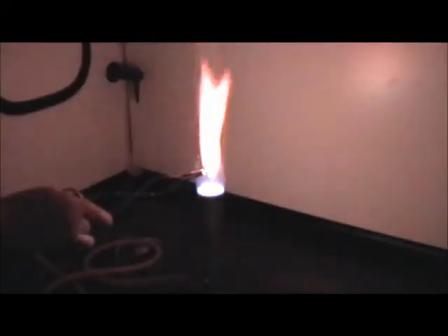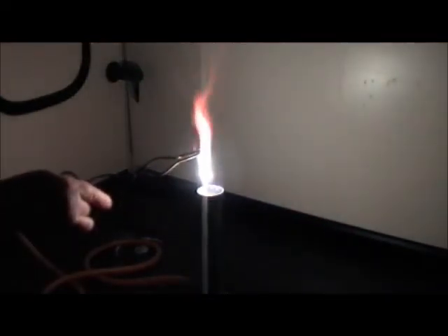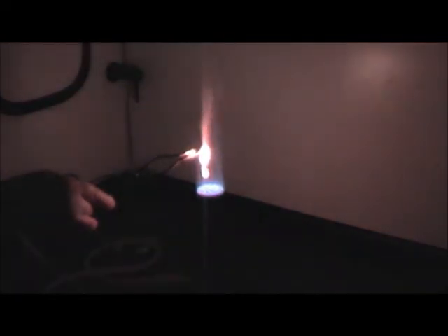Now for the first experiment, the combustion of magnesium, we'll need to combust the magnesium in the fume hood at the back of the lab. So your instructor will set that up and each group can burn the magnesium and we'll get rid of the nasty fumes. Just very smoky.